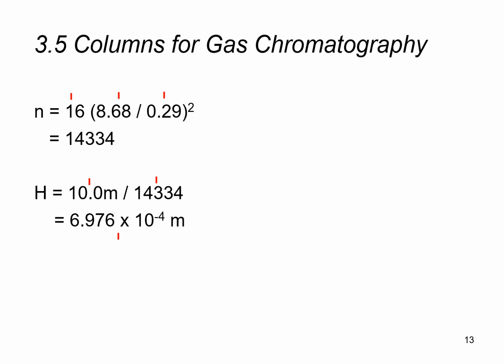What this actually allows us to do is that if we have another column and we are able to calculate the H, or the theoretical plate height, of that other column, then quite simply we can put these two side by side and figure out which is a better column for this analysis. Which column actually gives us a better separation efficiency? Obviously, the column that has a smaller H number will indicate better separation efficiency, and will definitely tell us that it is a more suitable column for use for this analysis.